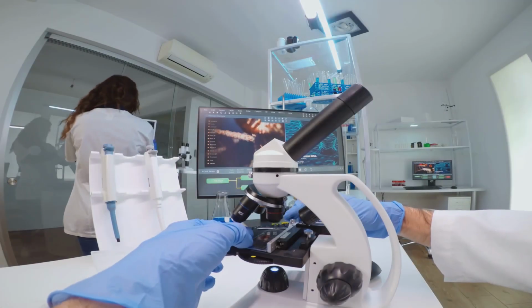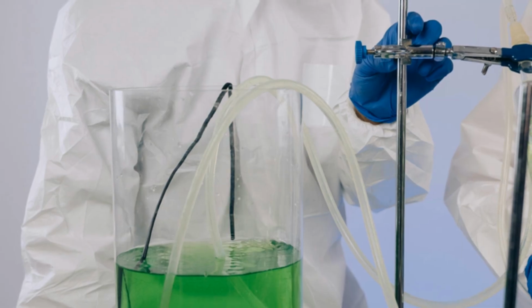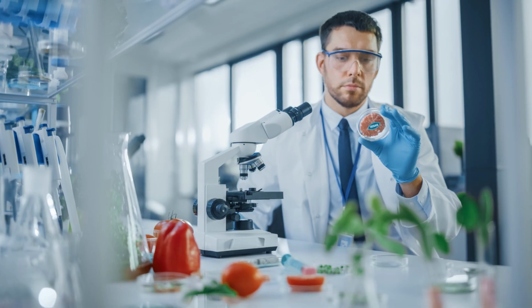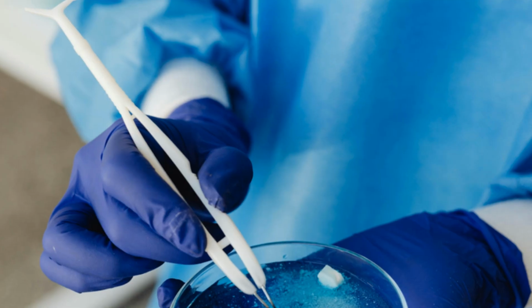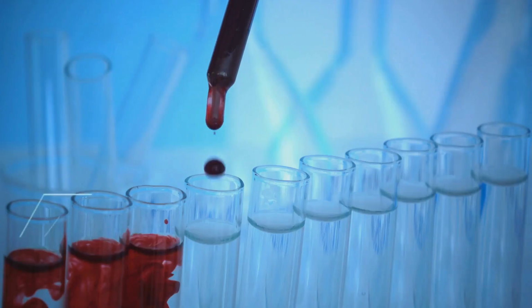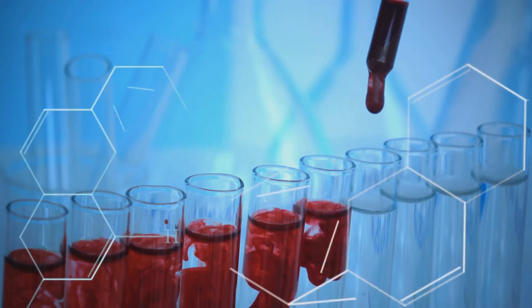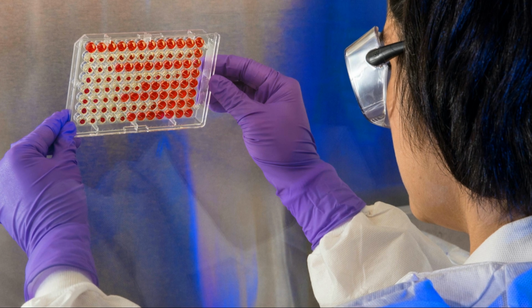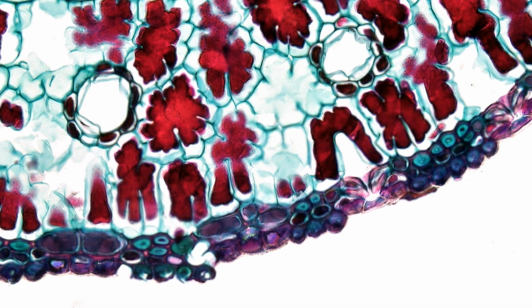The FIA process, from sample to stunning visuals. The process of performing FIA is akin to developing a photograph. It requires careful preparation, precise timing, and a bit of artistry. The first step is to prepare the sample, which could be anything from cells grown in a petri dish to thin slices of tissue. The sample is typically treated with special chemicals to preserve its structure and make it permeable to the antibodies. Next comes the staining step, where the fluorescently labeled antibodies are added to the sample and allowed to bind to their targets.